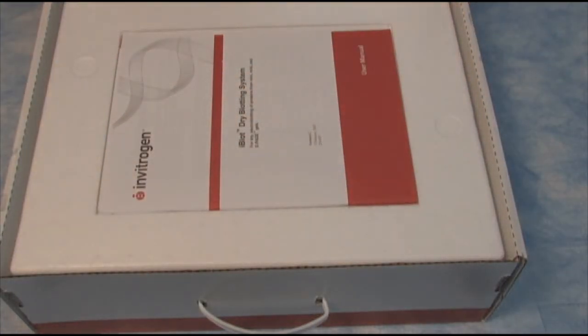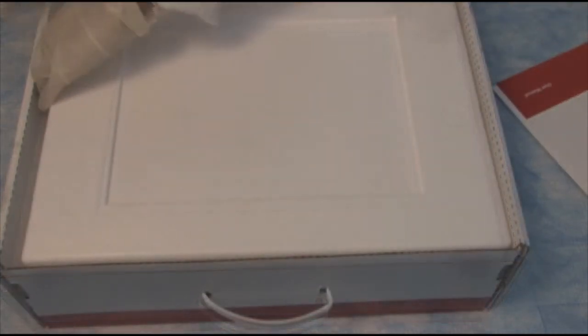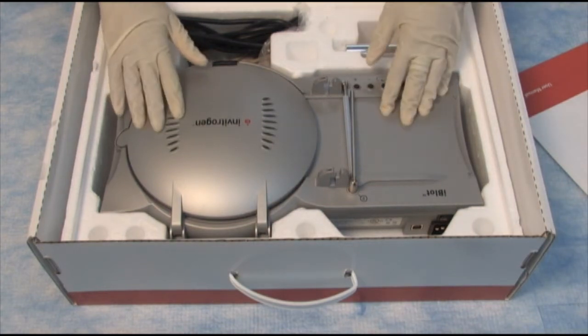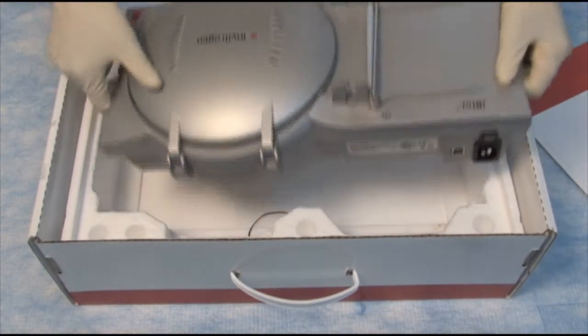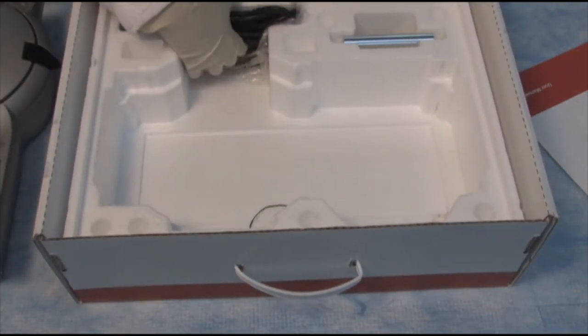Let's see what's in the box. We have a manual on top here. We have the device and we have a power cord.